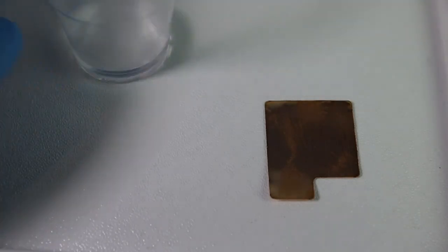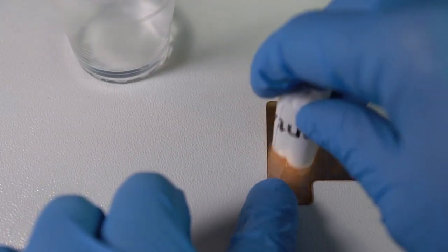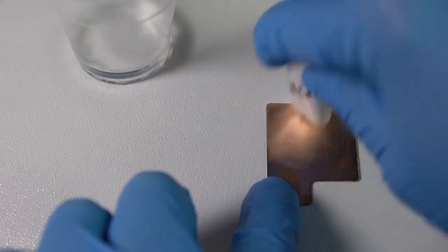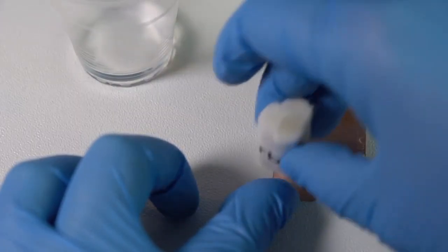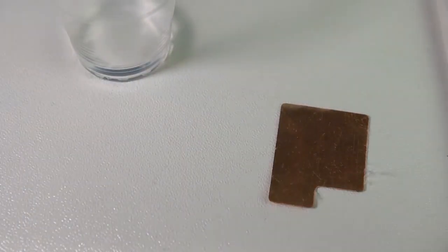Wet an absorbent with hydrochloric acid taken from the reagent pack. Remove the residues of copper oxide by wiping the copper plate with the wet absorbent, and then wipe it again with the dry side of the absorbent.